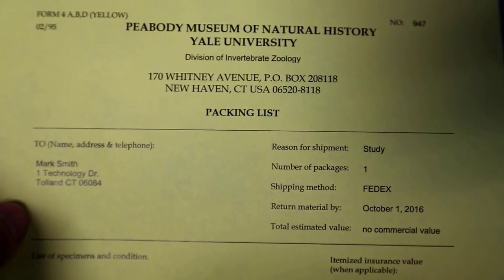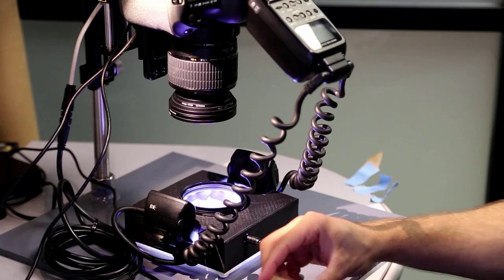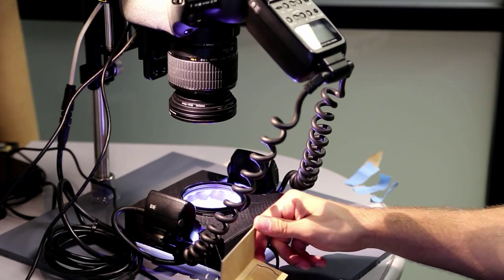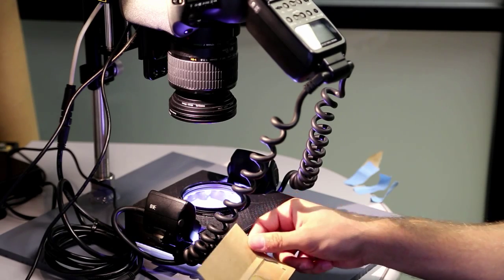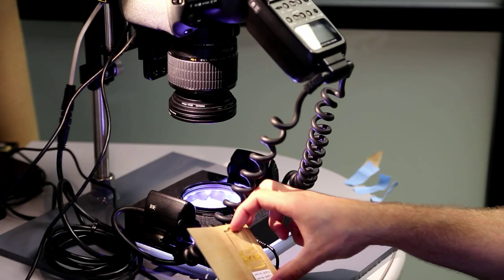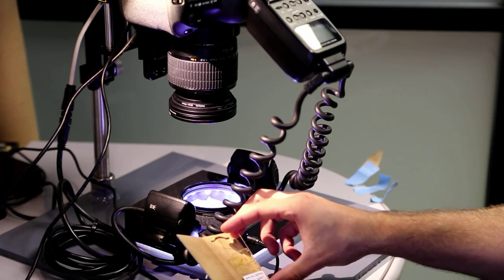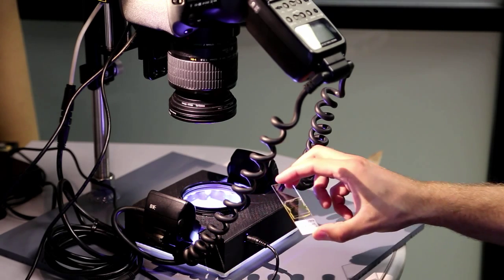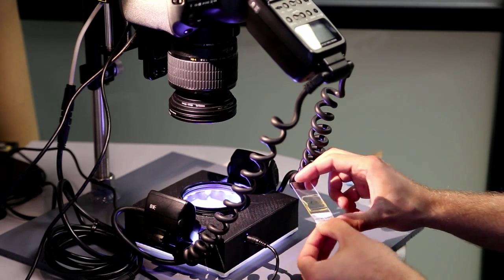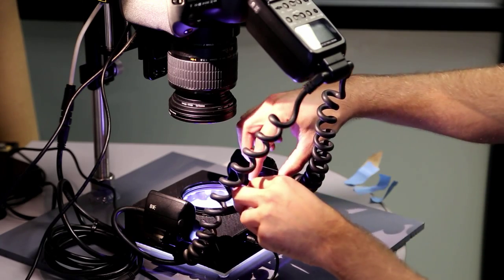I also want to tell you that this analyzer isn't just to be used for petrographic analysis. You can also use just standard biological slides. I've got some slides here that were sent to me from the Yale University Peabody Natural History Museum, and I can just pop this on the analyzer.